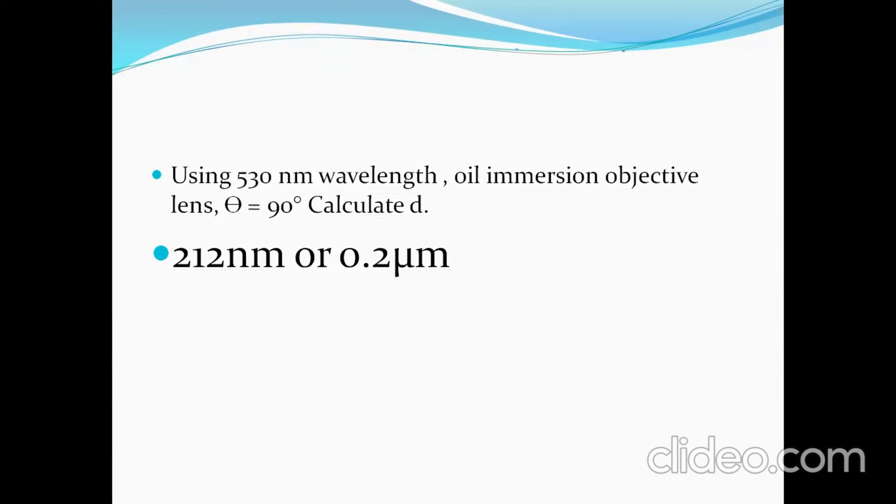In the case of 100x magnification, we have a magnification range up to 1000 or 2000 times. But if we increase the magnification and do not get better clarity in the image, the magnification does not work. As I have already mentioned in the definition, you have to create not only a magnified image but also a clear image. And that part is mainly done with this immersion oil.